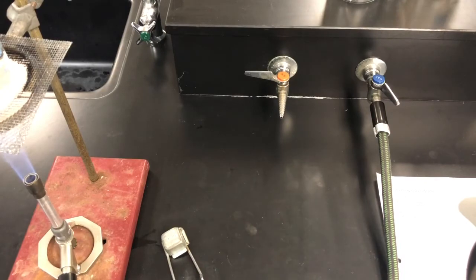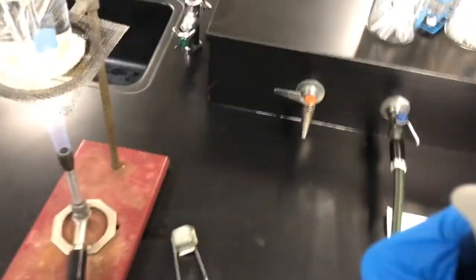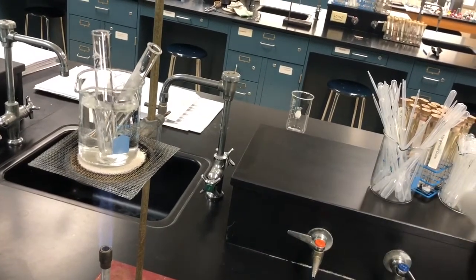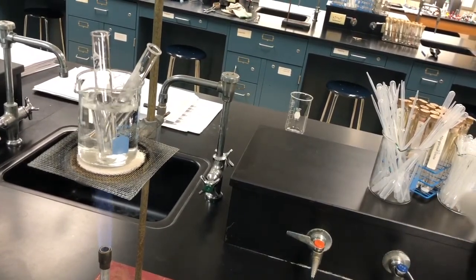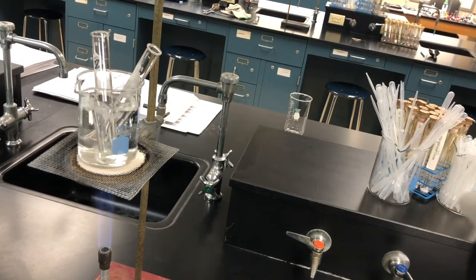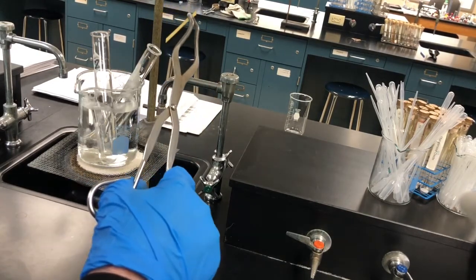Okay, so I'm going to adjust my camera just a little bit so you can see a little bit better. And I'm going to look at what the pH is of it. Okay, so I'm going to use a pH strip, and it should turn blue if it's positive for that test.